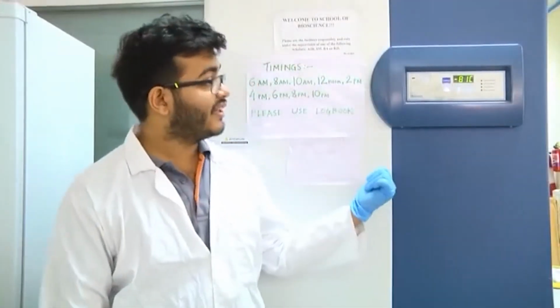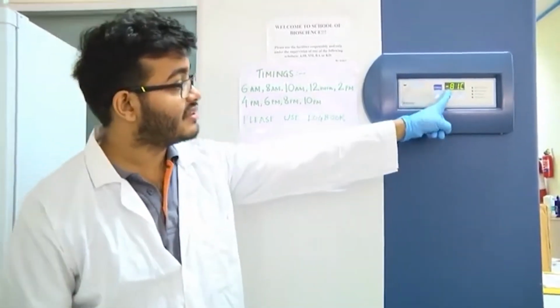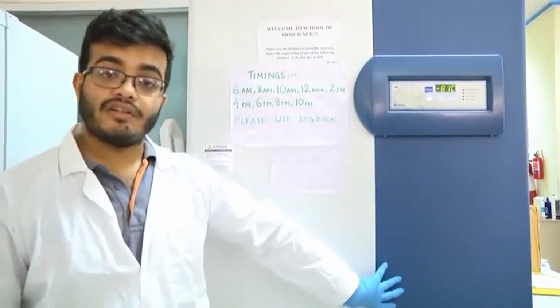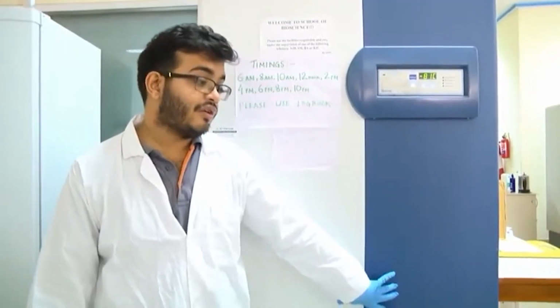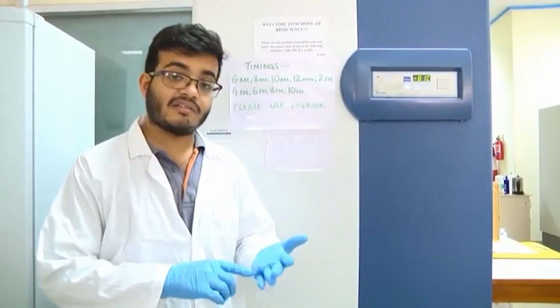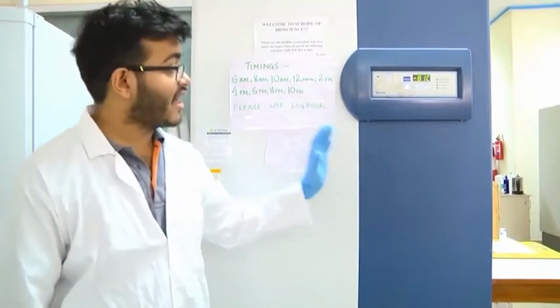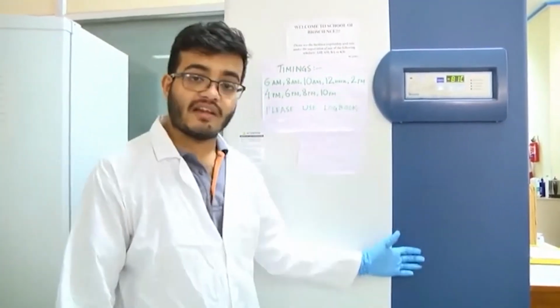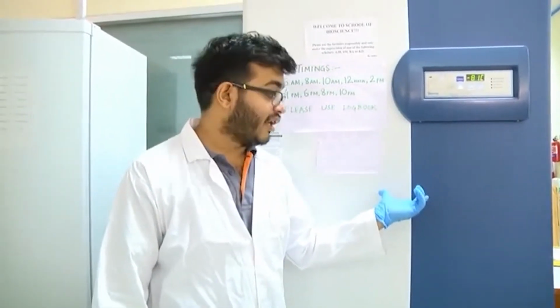The instrument that I have here behind me is a minus 80 degree centigrade freezer. As you can see, it is now maintained at minus 81 degrees centigrade. This is a very important instrument in any molecular biology or experimental biochemistry laboratory, because many of our bacterial cells or constructs are stored here. I will open the freezer and show you how it is arranged, how all the metal racks are kept, and how we have different boxes containing our different bacterial plasmid constructs.